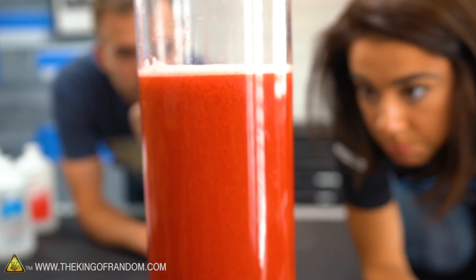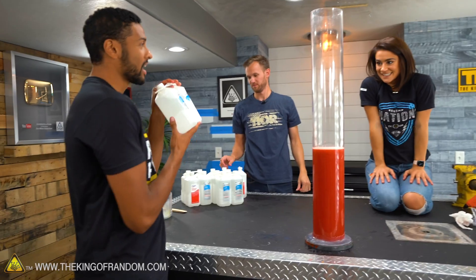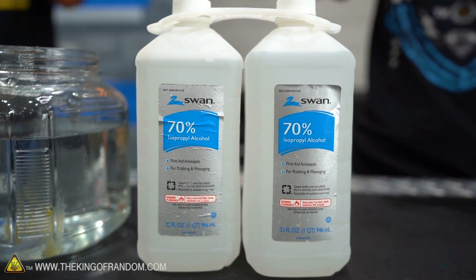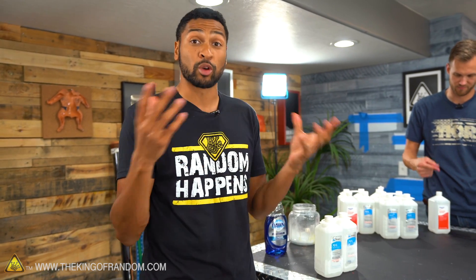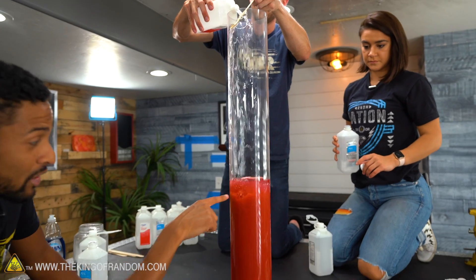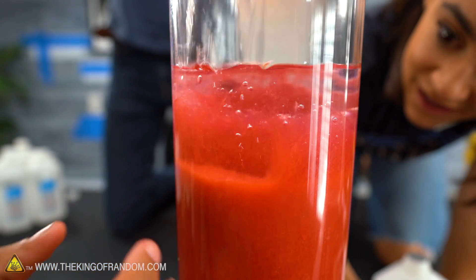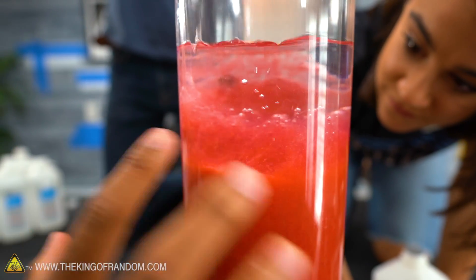We have just one step left. Science makes me happy! We're going to add our cold isopropyl alcohol or ethanol, and what this is going to do is separate the DNA from the water. Using cold alcohol is good because it'll actually slow down the enzymatic activity of the proteins that want to degrade free DNA — because if there's free DNA out there, that's what viruses have, and you don't want them sticking around. This will stop our DNA from getting broken down. And look — you can already see this thickness as it's separating. This thickness is all DNA, though it's dirty DNA right now, incorporated with RNA and proteins. Everything that's starting to come up right here is all the DNA from these strawberries.